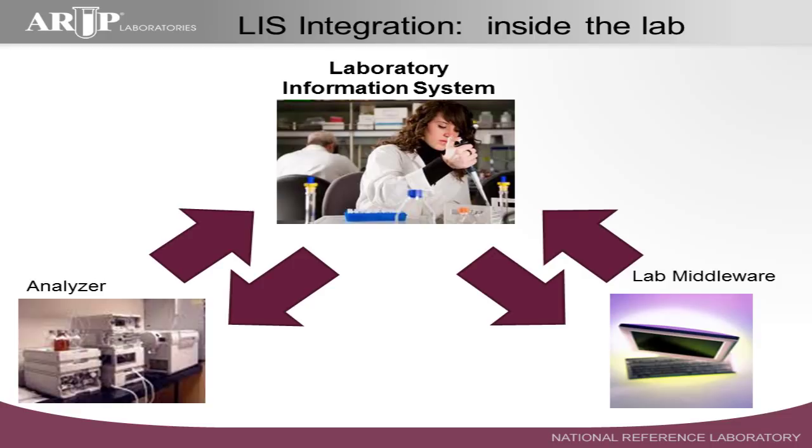But inside the lab, of course, we have interfaces with analyzers. And I don't know what the count is at ARUP right now. Some of you may know. I think it may be over 60, 70 different types of analyzers that we have interfaced to the LIS.